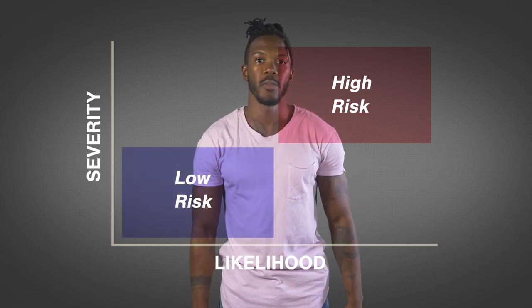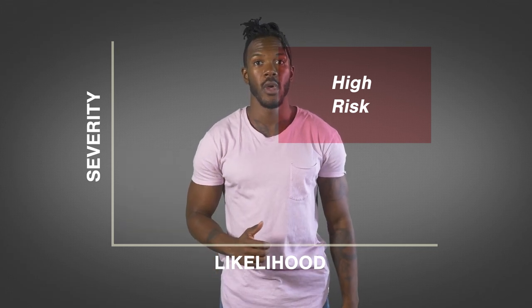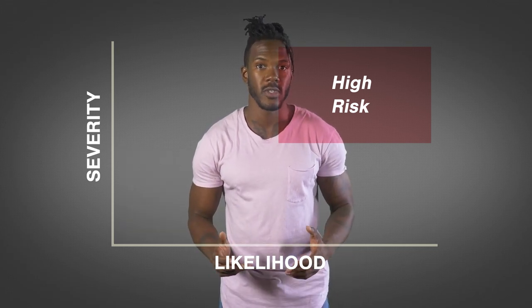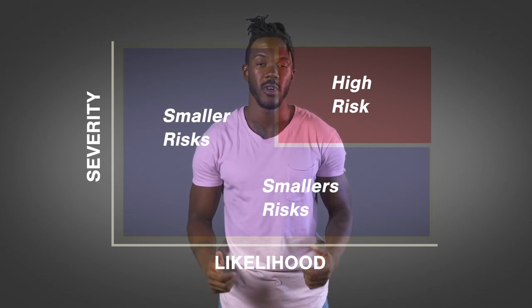Obviously, you and your teacher should pay special attention to activities that carry the highest level of risk and danger, but don't completely ignore smaller risks just because you think they're unlikely to happen or the consequences won't be that severe. Let's apply this thinking to a commonly used lab chemical, hydrochloric acid.